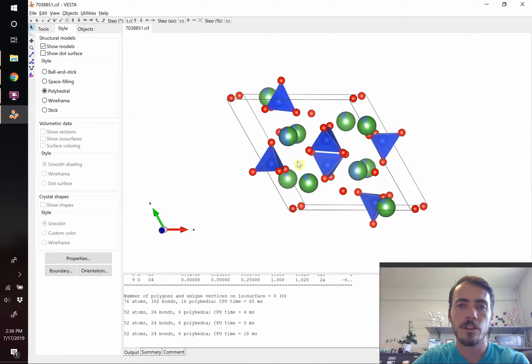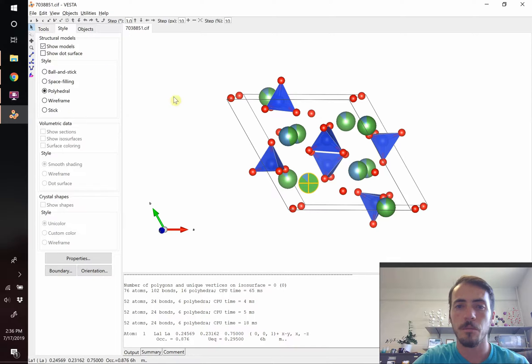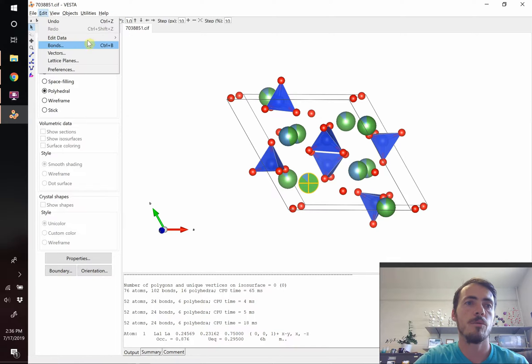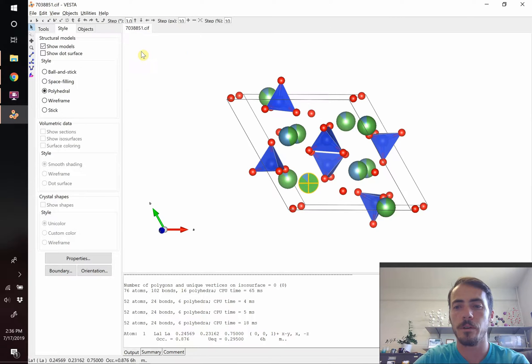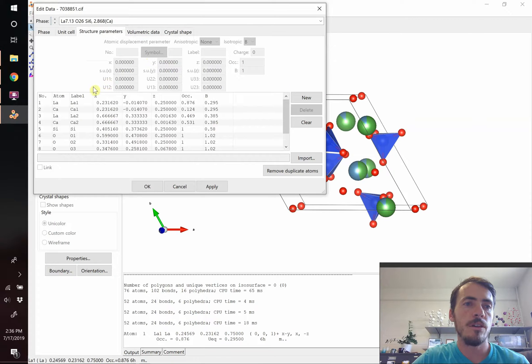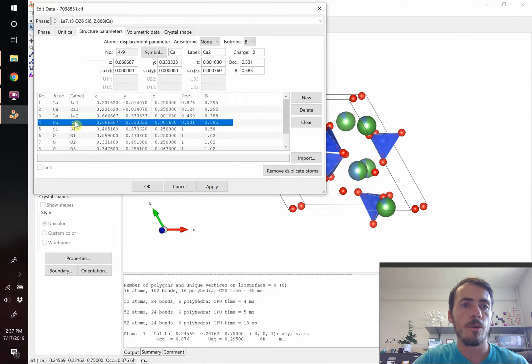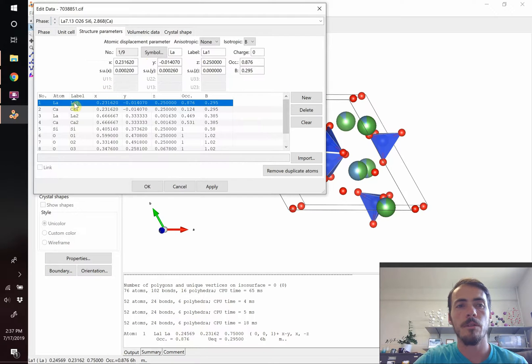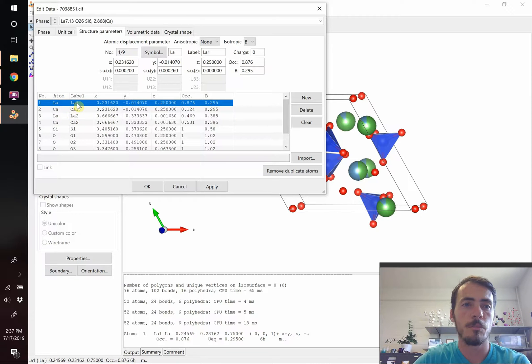First, let's fix the other problem. First off, this is lanthanum, and it's not gadolinium, so let's change that. We're going to go to edit, we're going to go to edit data, and we're going to go to structure parameters. Here you see the first four entries are the cations we care about, lanthanum, calcium, lanthanum, calcium. And they're spread over two sites. You've got site number one and site number two. Those are the same ones that I've got labeled here, A1 and A2.